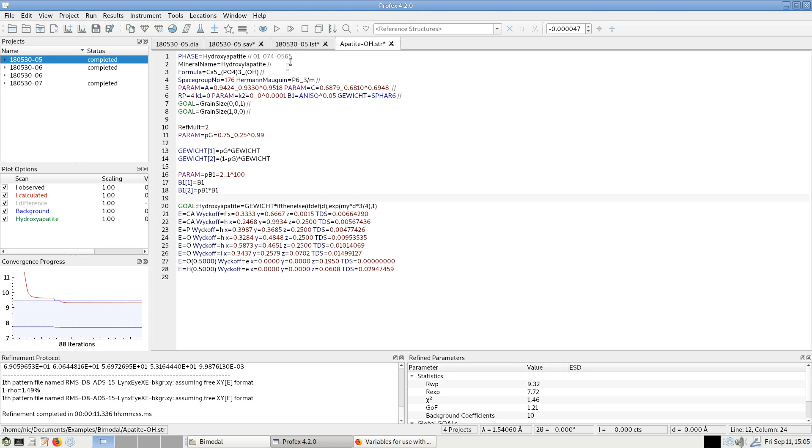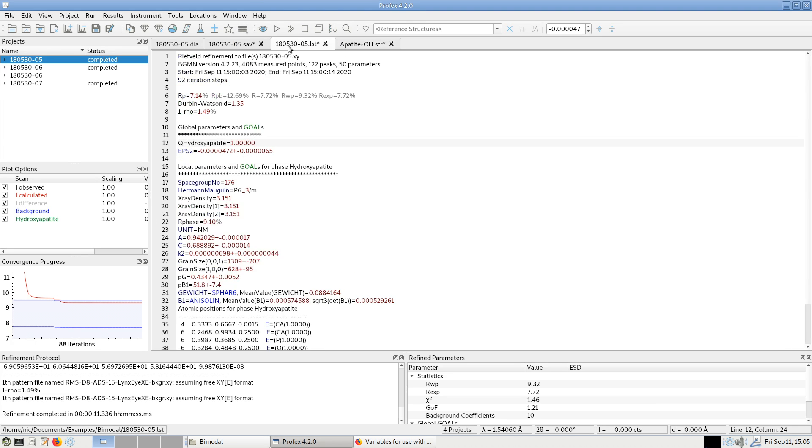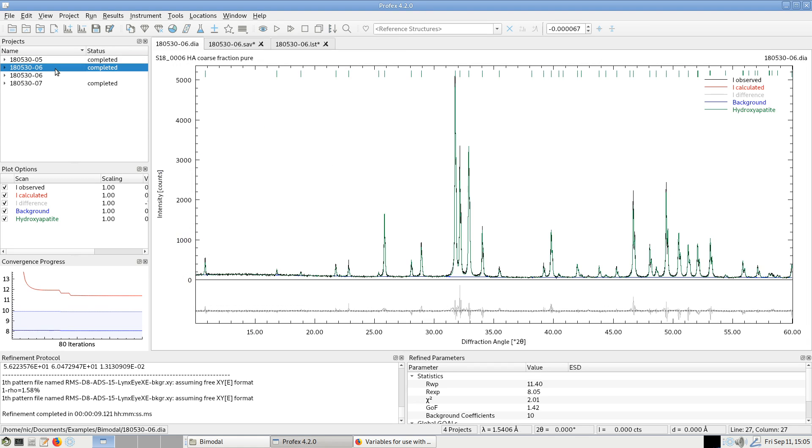You may be wondering why the refined crystallite size of the coarse fraction, 1309 nm, is much larger than the value we refined when we refined only the coarse fraction here.